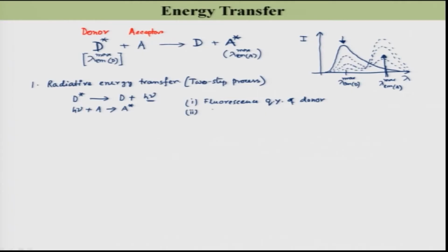2, I can write the concentration of A, and 3, I can write that overlap of emission. So, these are the three conditions.